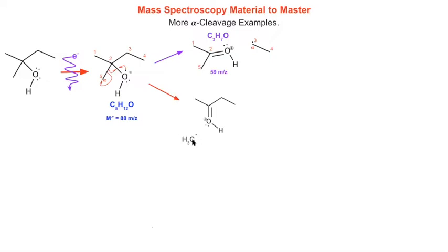And a methyl is carbon 12 plus 3 hydrogens. So what should a methyl weigh? A methyl should weigh 15. It does weigh 15. So people who use mass spec a lot will often look at the mass spectrum and look for a minus 15 signal from the molecular ion. If they see something at minus 15, they're like, oh, that molecule has a methyl in it. It tells them right away, I got a methyl. It's kind of a nice little thing to notice. Okay, and I can number my carbons so I didn't forget any. And then, yeah, I got my formula.